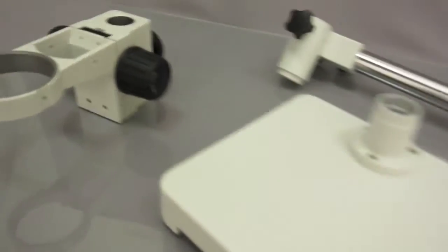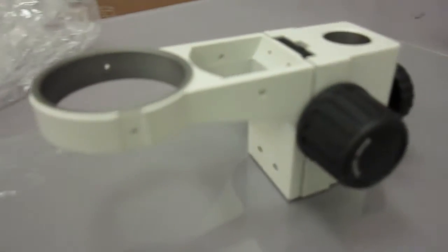There's a number of different parts. First, you have the focusing rack. That's where the head of the microscope is placed.